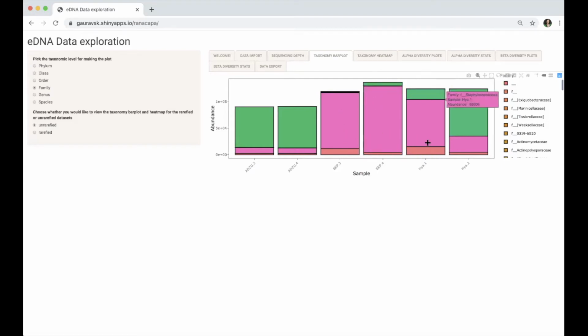So there's a lot more in this particular sample than there is in this one. And so these are the kinds of things you want to do across all of your samples. You want to compare your two different replicates. You want to compare across types. So I can compare how different the Adzuki microbiome is compared to the black-eyed pea microbiome, et cetera, in terms of the types of bacteria that are observed and their abundance.